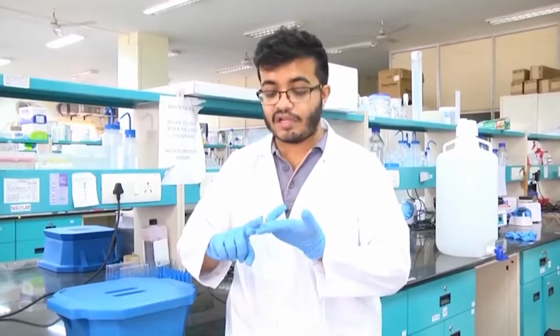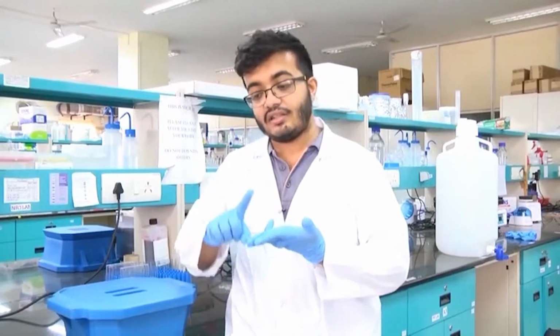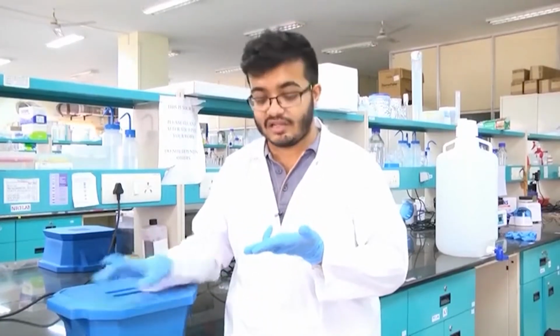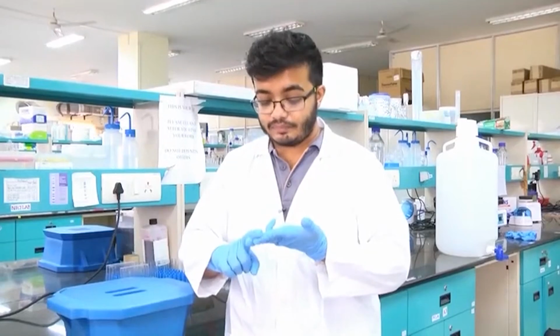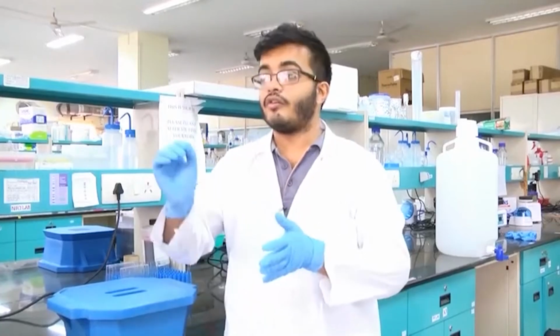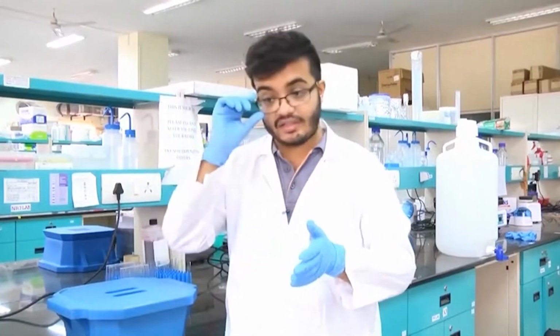Once we began the experiment, in the initial phase they were kept at 4°C. After DNA was added, they were still incubated in ice. They were always kept in ice, and only during the process of transformation are they suddenly kept at 42°C for a very short duration of 45 seconds.